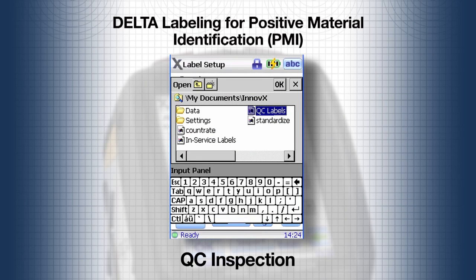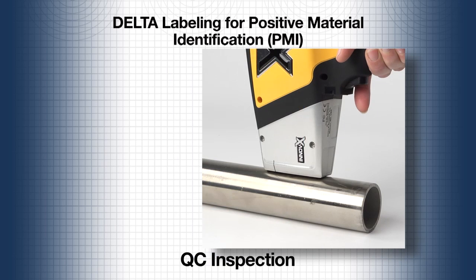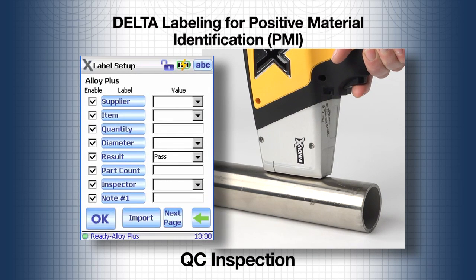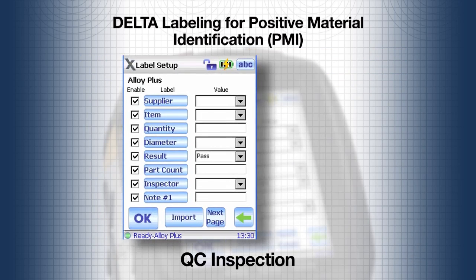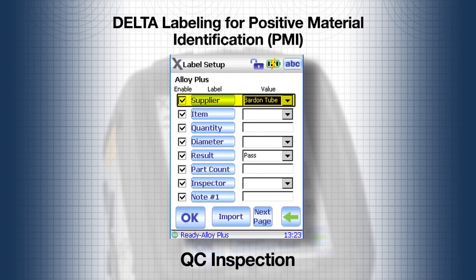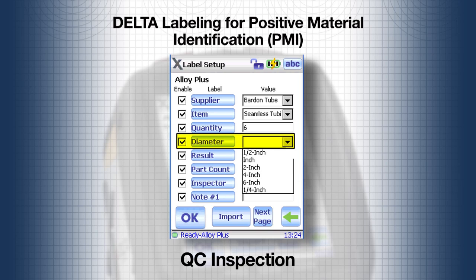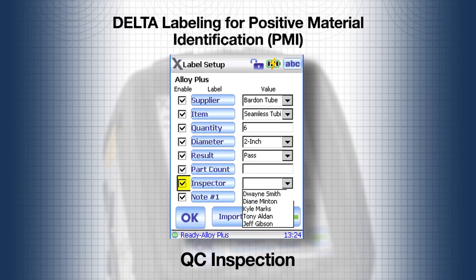The QC labels have already been imported and are ready to use. From the test window, pull the trigger and the label setup window opens. Select all the options needed for this test, including the supplier of the item being tested, the type of item being tested, the number of items being tested, the diameter of the items being tested, and finally, who is performing the testing.